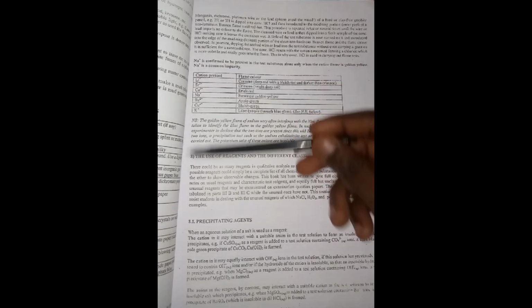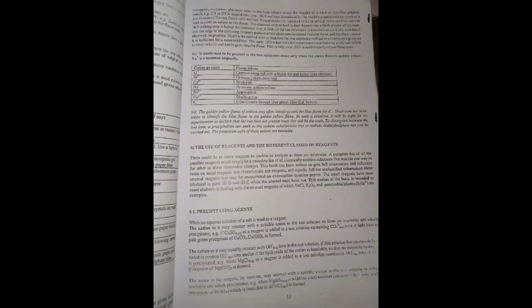So guys, this is how you practically open it. Each time you're doing your flame test, you just go to your reference booklet and open to the flame colors. Okay, friends, I believe that we know a bit about the flame test now, right?